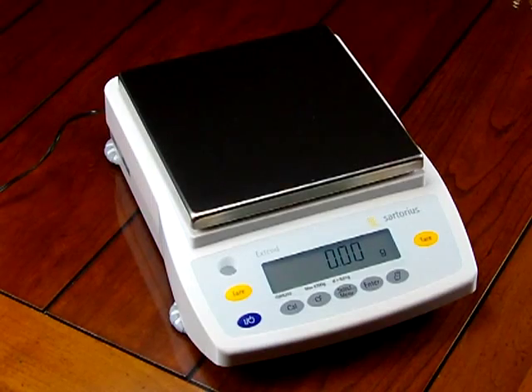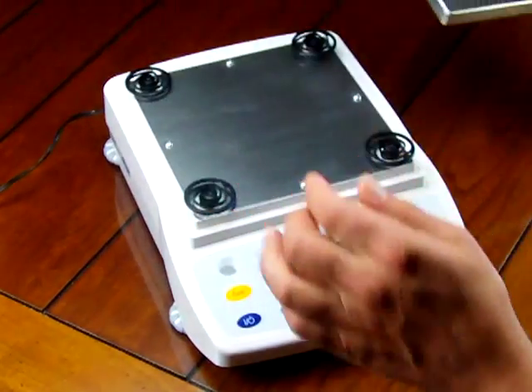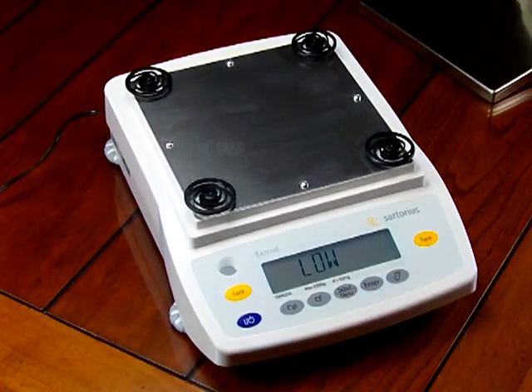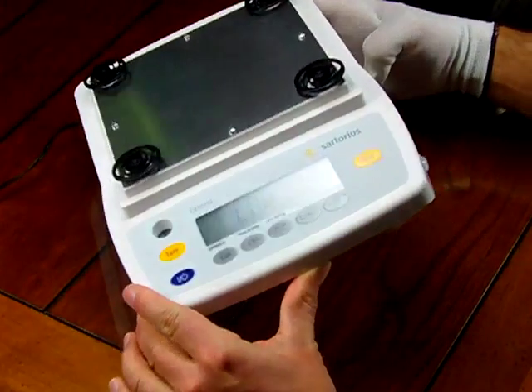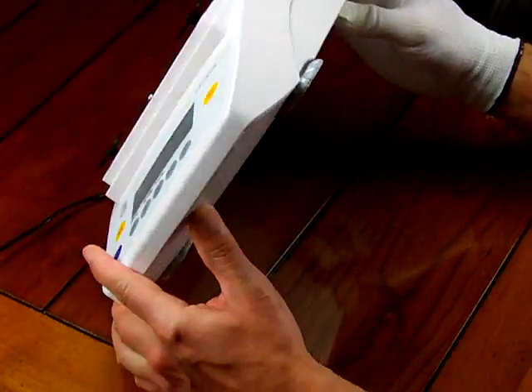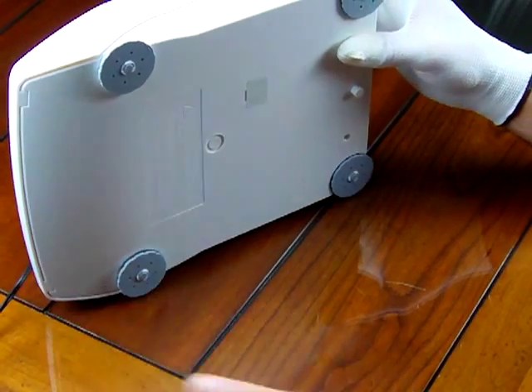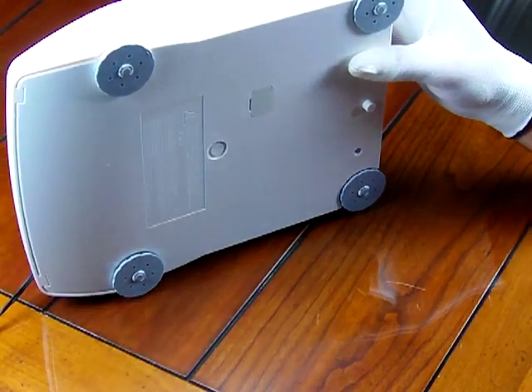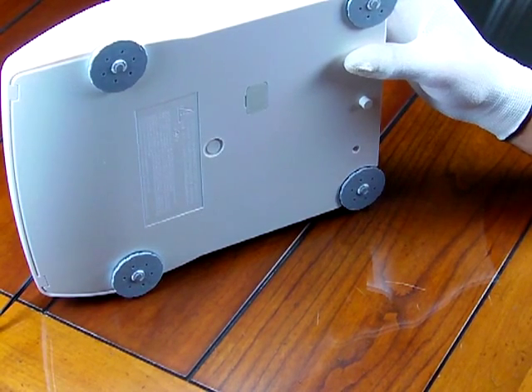The balance also offers four adjustable feet. A lot of other brands on the market only offer two adjustable feet, or some offer none whatsoever. On the bottom of the balance you'll see the four adjustable feet for leveling. This is critical — when you weigh, your balance has to be level.